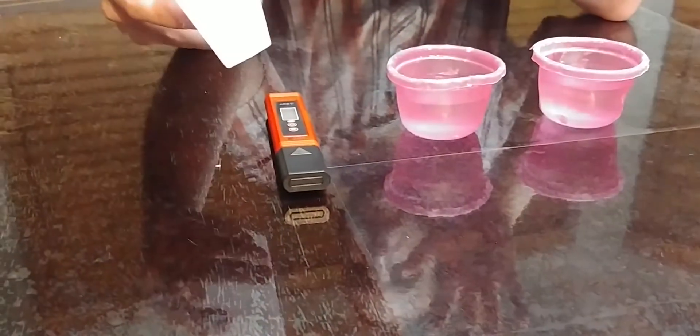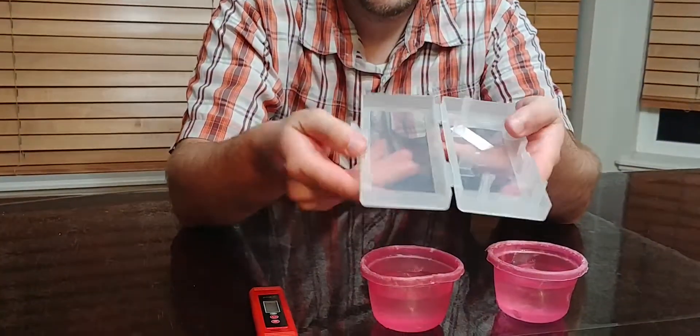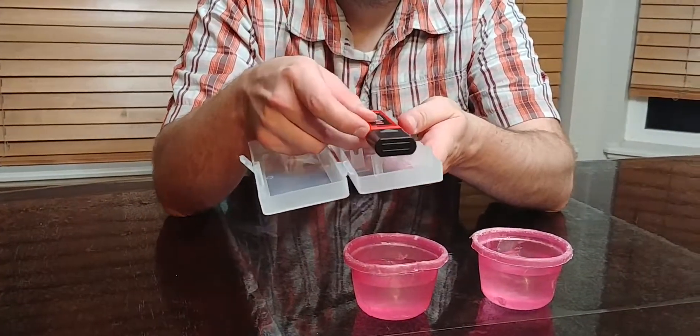So what it comes with — it comes with this nifty little case you can hold it in. It fits right in there.